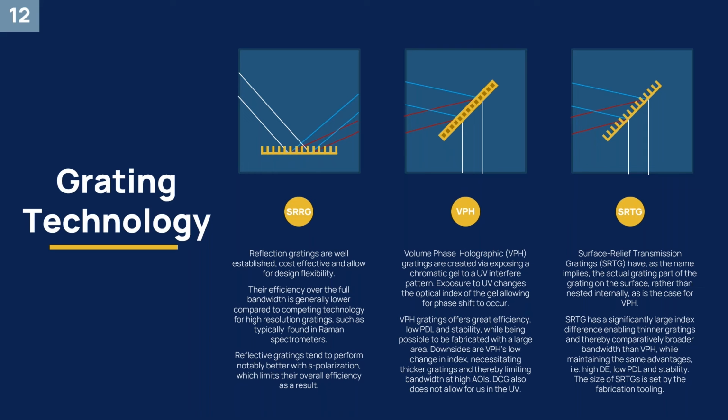This is a tried and tested technology, of course, and it enables great design flexibility, because the tilt of the grating will affect the position of the wavelength diffracted by the grating. So it's really good in something like an experimental system where you are not quite sure what wavelength you want, or if you want something that's made to custom. It can also be good, because you can easily change the bandwidth that you're looking at by just tilting the grating, at the cost of some efficiency naturally.